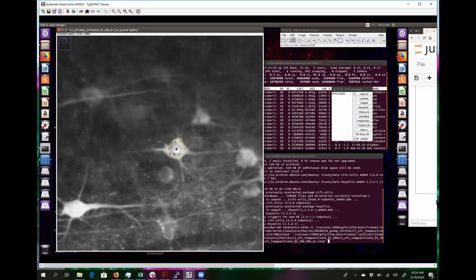So that's just one thing that you have to keep in mind. Imagine your Z section is about 5 microns, which is typical in tissue with a high NA objective. Then if your Z plane moves by 3 microns, that's already a lot. You're actually imaging a completely different part of the cell. So you'll actually see changes that are purely due to motion, not due to dynamics.